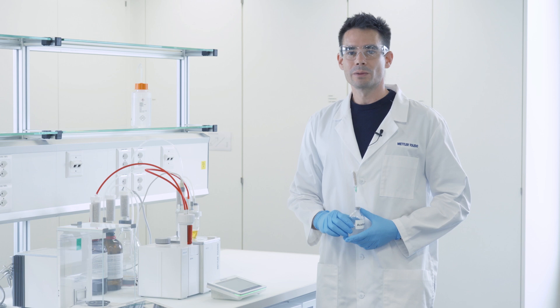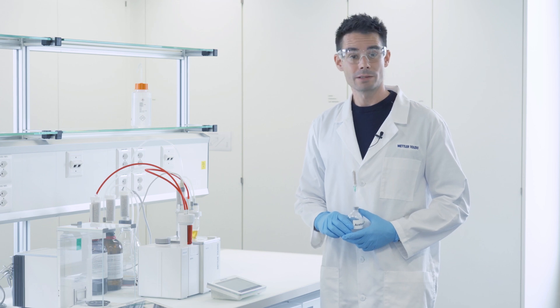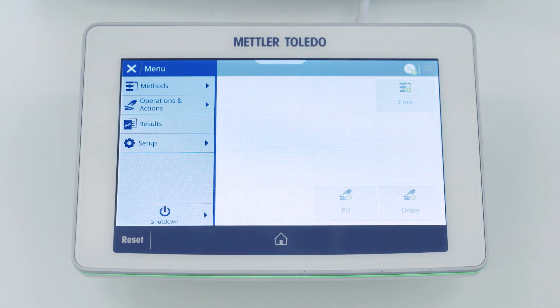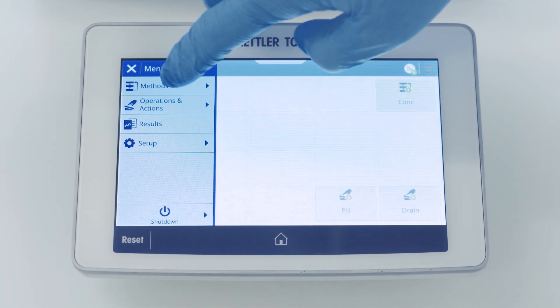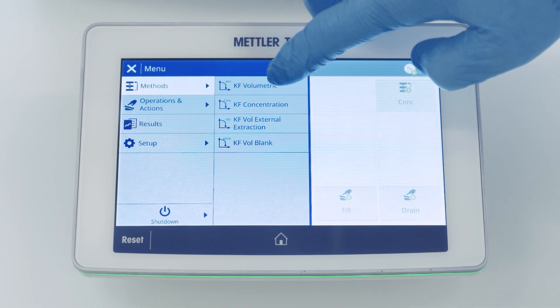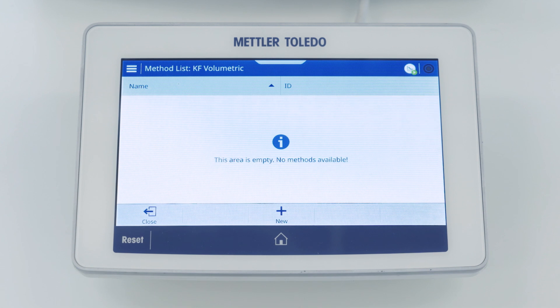To determine the water content of our sample we first need to create a method on our instrument. This is very easy and I show you how to do it on an EVA titrator. First go to the menu and we find the methods and the normal volumetric Karl Fischer methods in a list. Now our list is empty because we haven't created a method yet. To create a new method just click on new.